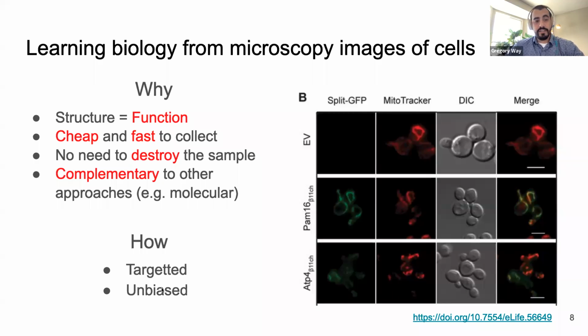There's also unbiased categories where, for instance, in the same experiment, the authors have also tracked MitoTracker. So this is a generic stain that's going to report on the localization of mitochondria in general and the distribution of an organelle that's really important in a lot of biological function. And so I'm going to focus on the unbiased approaches to learning biology from microscopy images. I think that this is really where we're going to learn a ton of information about disease and drugs.